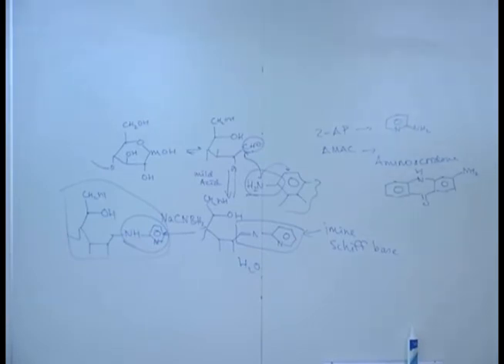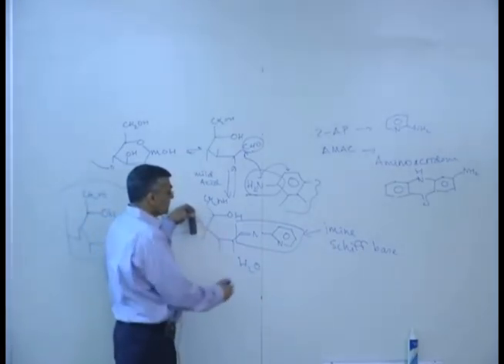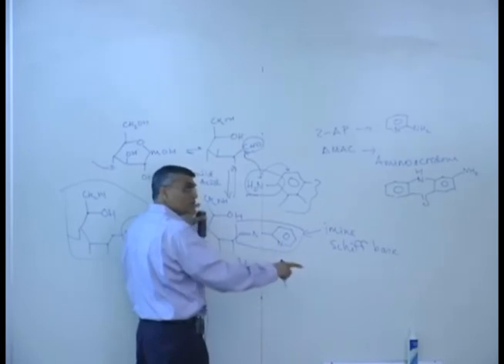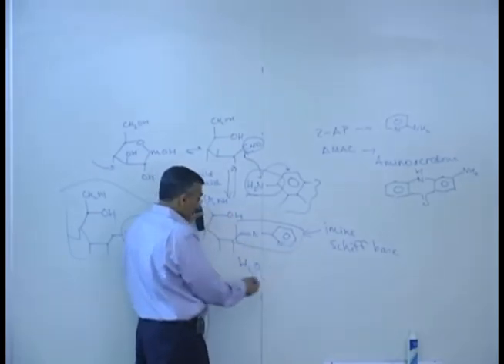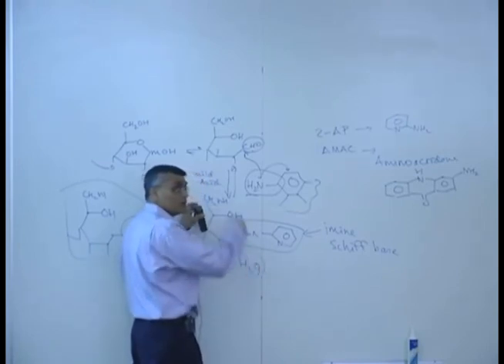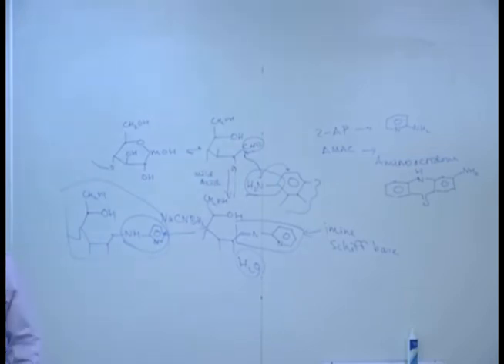Once you pass it through the detector, you engineer conditions so that it passes through the detector, and that's what I'm saying. You don't do this reaction. In this particular state, you use it for detection, and then you put it in water, and over a period of time, water would hydrolyze that bond and you get it back. So you can exploit it under really tricky conditions if isolation is a problem.